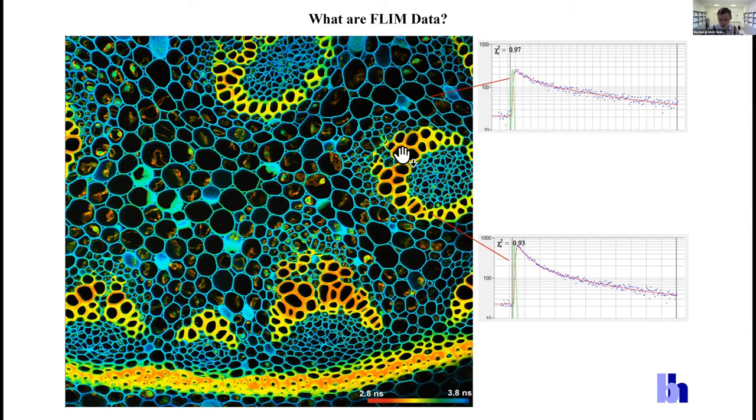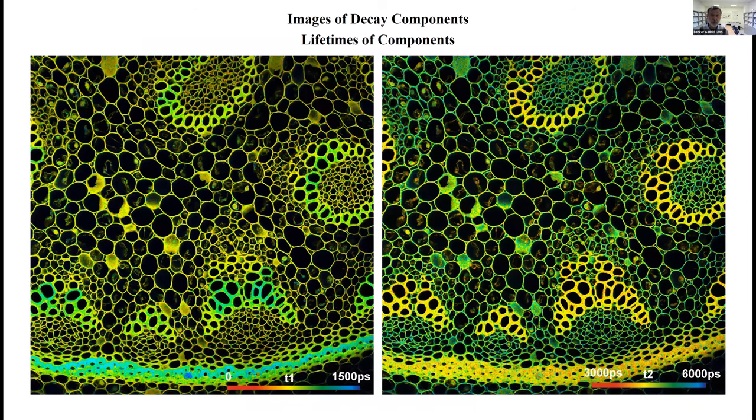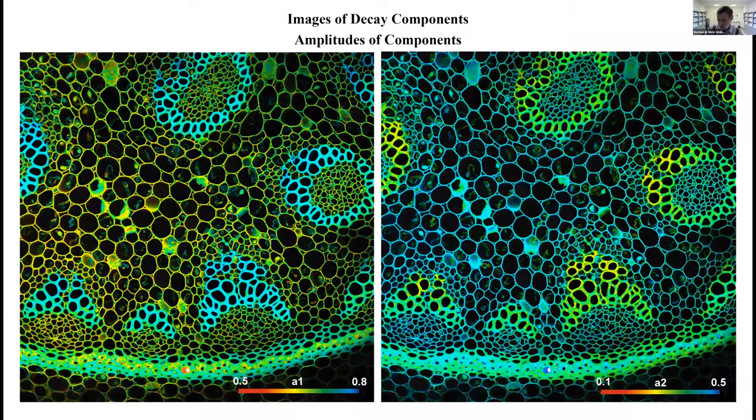In most cases in biology, the fluorescence decay curves are not single exponential, and in those cases you may be interested to see images of the individual decay components. Of course the software does this. These are lifetime images of the decay components and these are the amplitudes of the components, so full information about the decay curves.